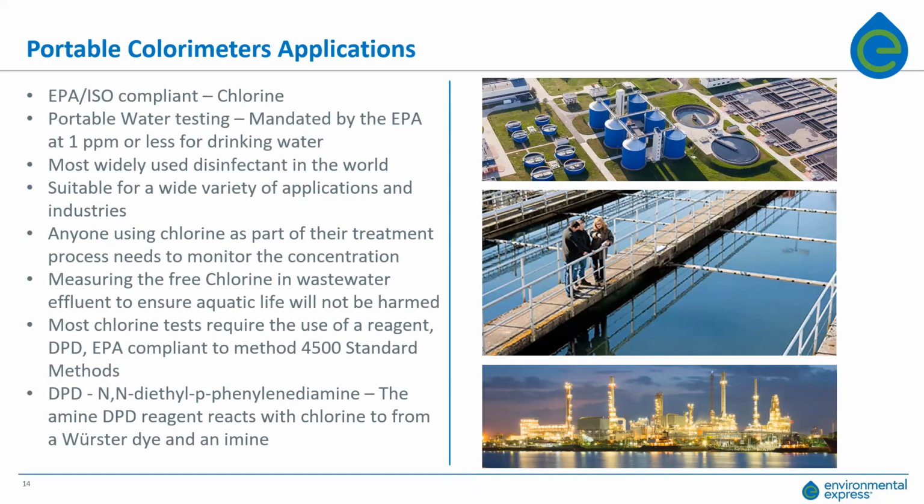And again, the reason they disinfect is to kill the bacterial and viral components, but you also want to maintain a free chlorine residual in your storage tank or your distribution network. This is the most widely used disinfectant in the world. It's suitable for a wide variety of applications and industries. Anyone using chlorine as part of their treatment process needs to monitor the concentration of chlorine.